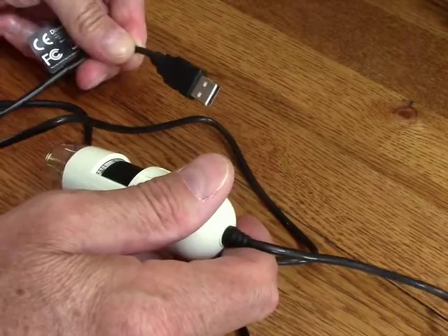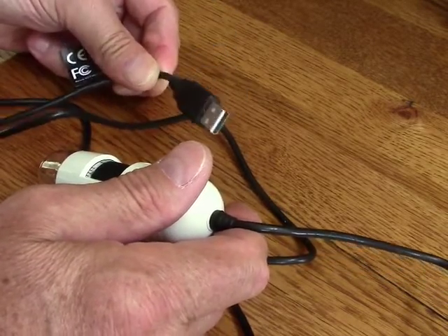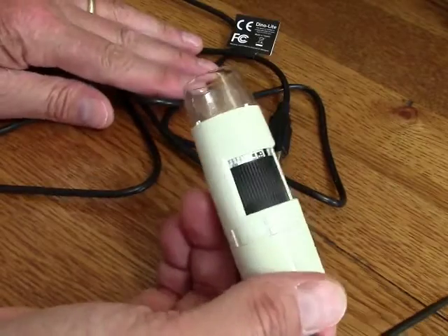This connects to your Macintosh computer or it will also connect to a PC just using the USB cord. The cord is pretty lengthy, it's almost 6 feet long, so it gives you some flexibility in how you can use this.